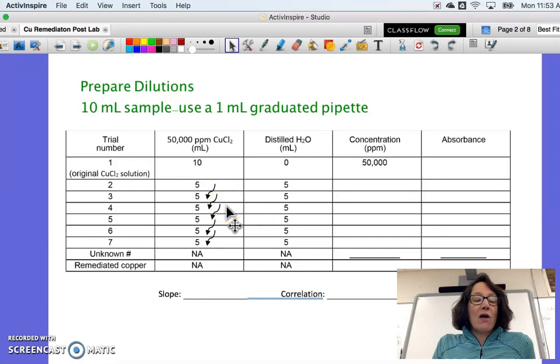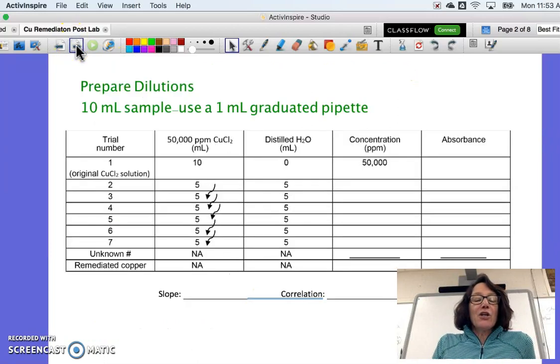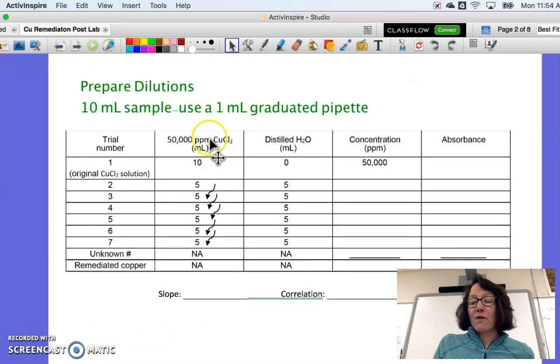Notice that your data table also has a spot for you to record which unknown number you're assigned and the concentration and absorbance of that. After you do step 2 of the lab with your unknown and you pull out that copper by reacting it with aluminum, you're going to take the filtrate from that solution, which is your remediated copper solution. So you're actually going to be testing this new aluminum chloride solution that formed to determine if you indeed were able to get all of the copper out of that.